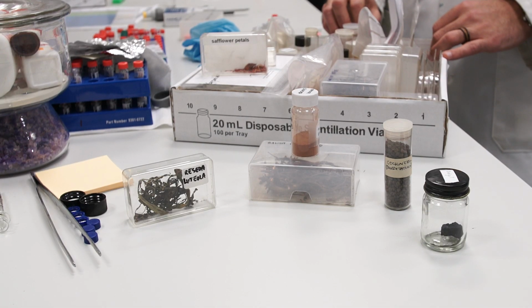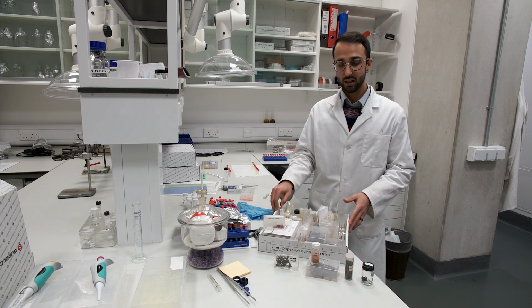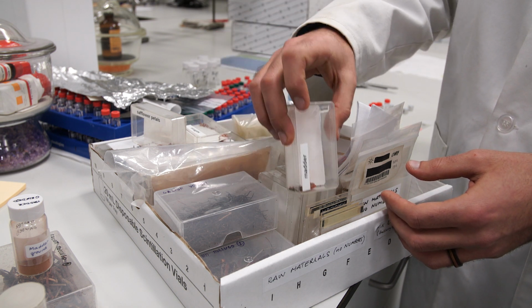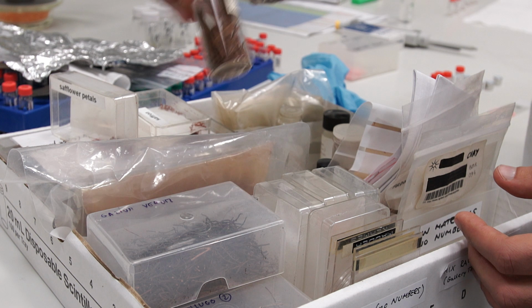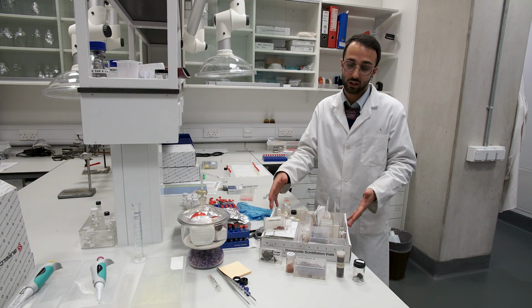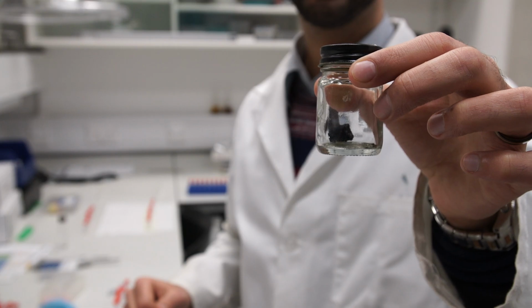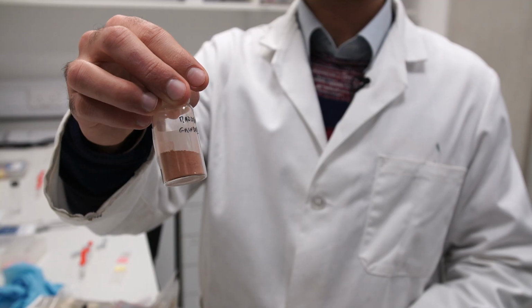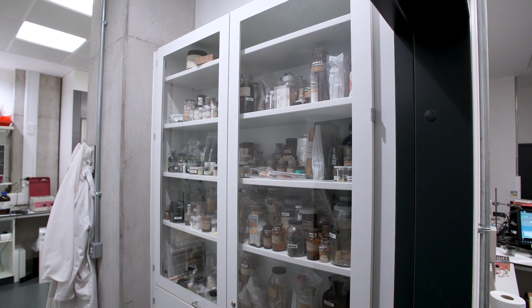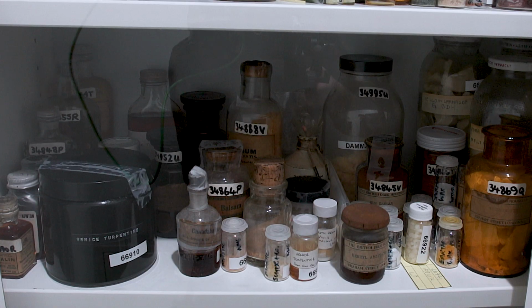This is just a small part of the British Museum reference collection. Every time we look at something that comes from a specific geographical area, we need to have the proper reference collection. And this is how the collection of the British Museum was built. We worked on different objects from different geographical areas from all over the world, and during the years people actually went there and acquired reference materials to be able to compare their results to this.